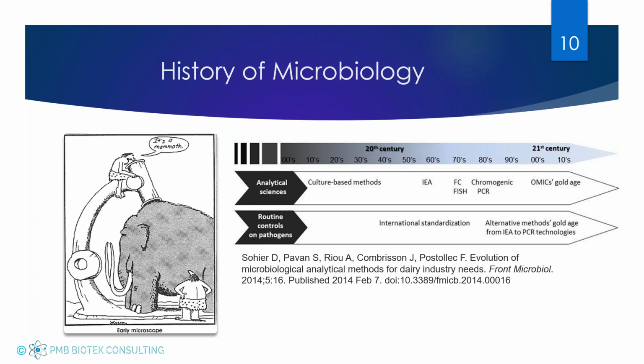What's interesting is that certain states are requiring more culture-based methods for cannabis. So we're retraining labs and microbiologists on these techniques, because universities have moved beyond the initial basic training skills that we use for these and moved to more high-end and rapid detection.